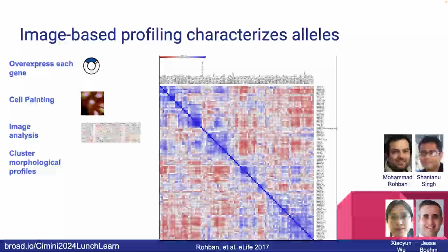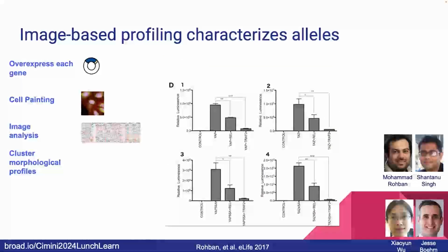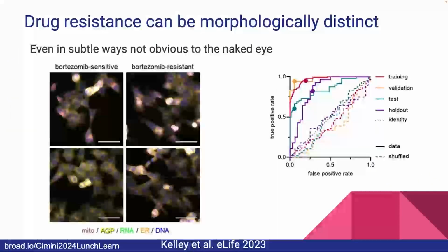And Mohammed, who now has his own lab, went through and found some pathway interactions that were not predicted by the literature. And we built a reporter gene, and it turns out that we discovered novel pathway inhibition from organelle dyes. And I was just like, holy crap, this thing actually works, and this actually lets you learn biology. And so we've done a lot with that in the last few years.